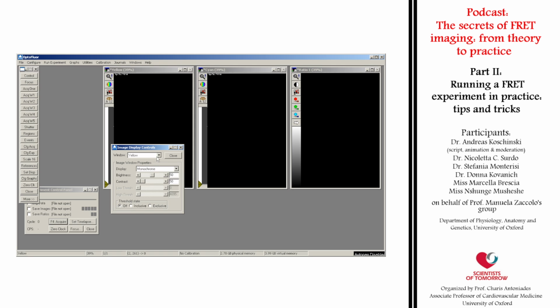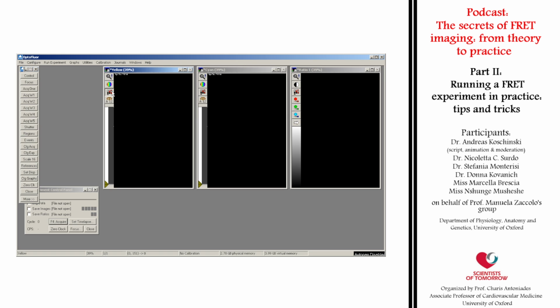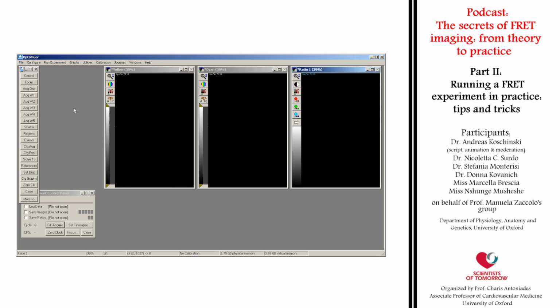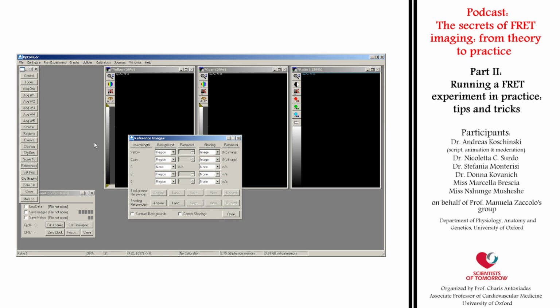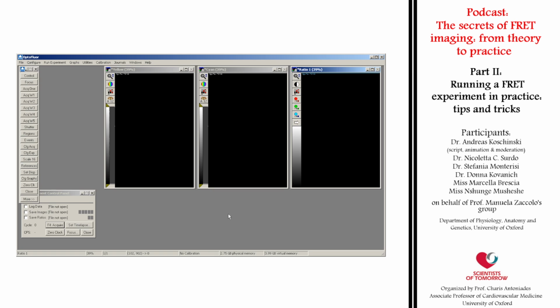Thresholds can be set either in the display menu or with a button and the sliders on the left control bar of each wavelength window. We recommend to do it first with the menu, then close the menu and do it again in the bar. There's also an issue with some image processing. As I will show you later, the program can do background subtraction. However, if you do so during acquisition, the software will save the processed data instead of the raw data. Your original data will be lost, so better refrain from any processing during acquisition.